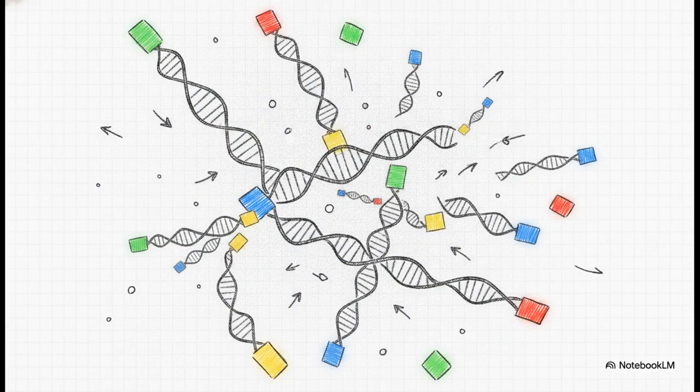Now, the beautiful irony here is that to read a complete DNA strand, we actually have to create millions of incomplete fragments of every possible size. Since we have millions of template strands in our tube, and those stop signs are incorporated totally at random, the stopping point is different every single time. One chain might get 10 bricks in before hitting a stop sign. Another might get 11. Another might get 50 or 300.